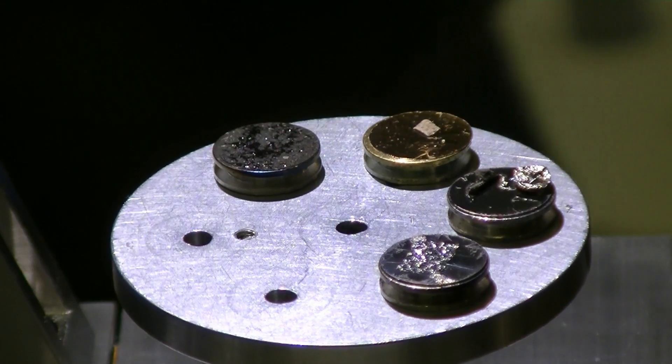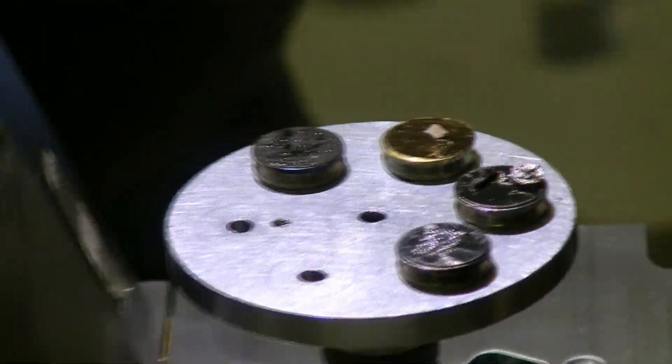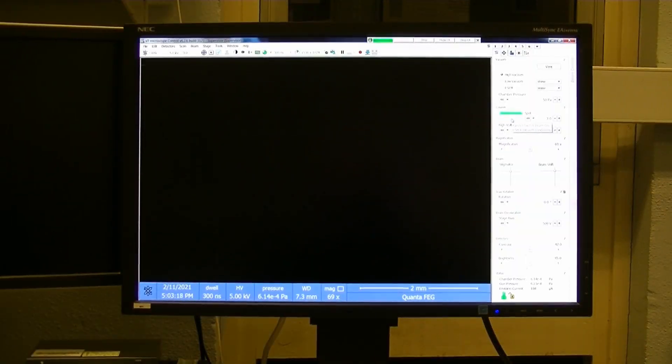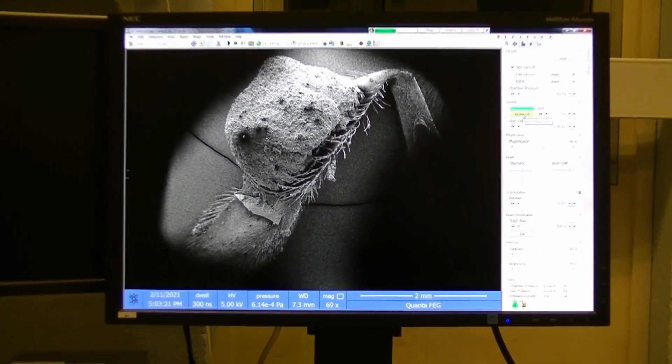Samples are loaded into the microscope, the door is closed and we pump it down to a vacuum. When the chamber has reached the correct vacuum level we can switch on the electron beam and begin to scan the surface of the sample.